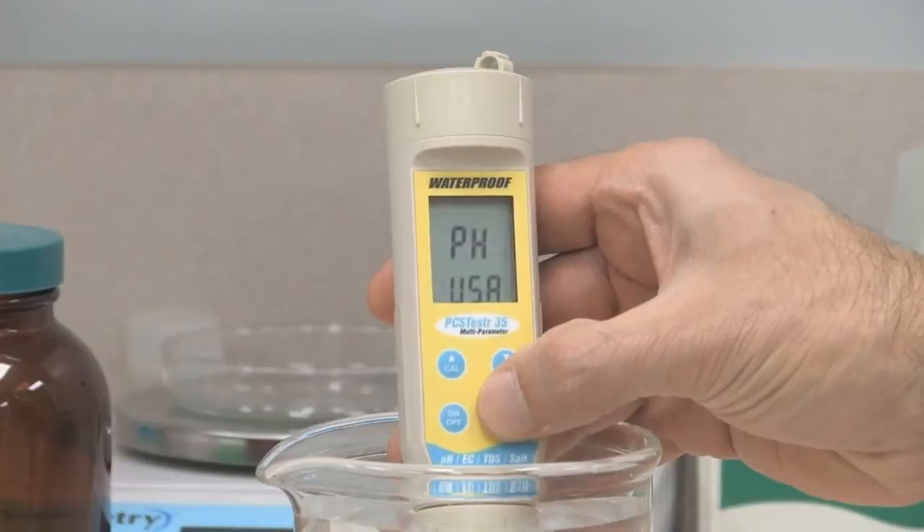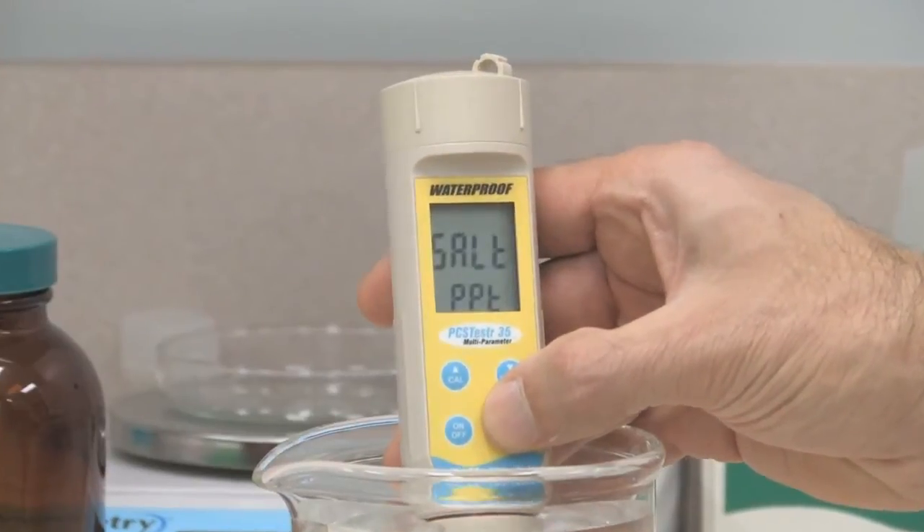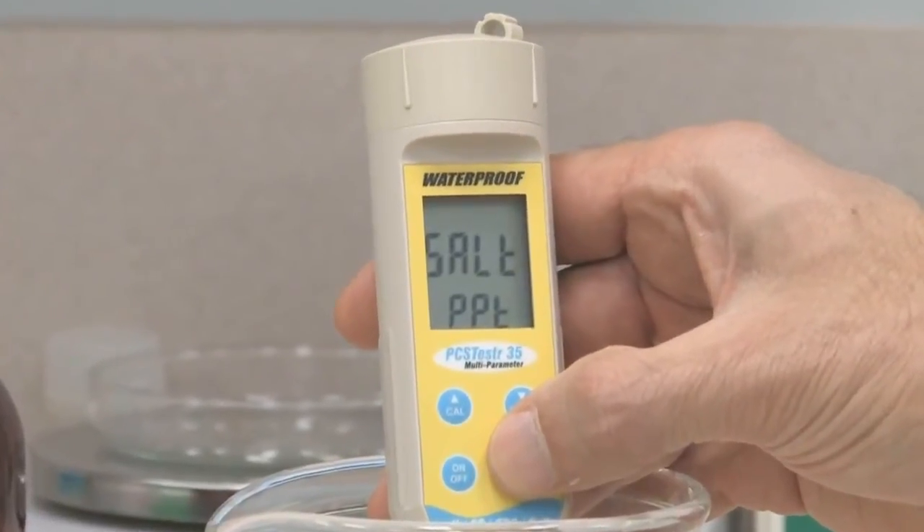Determine pH, conductivity, TDS, salinity, and temperature, all in one convenient tester.